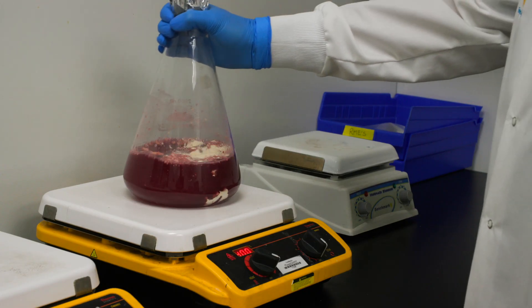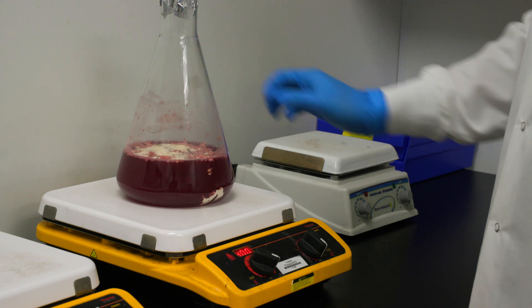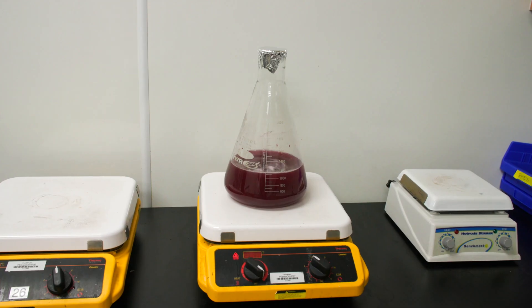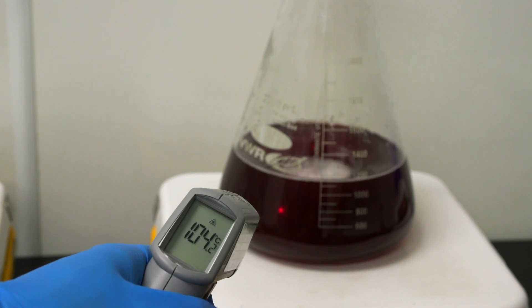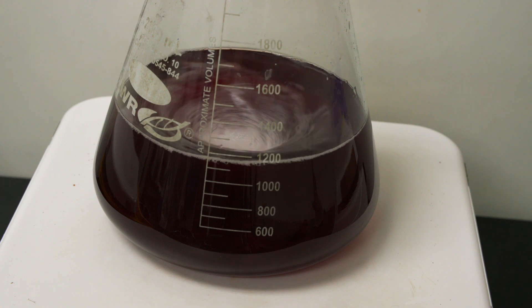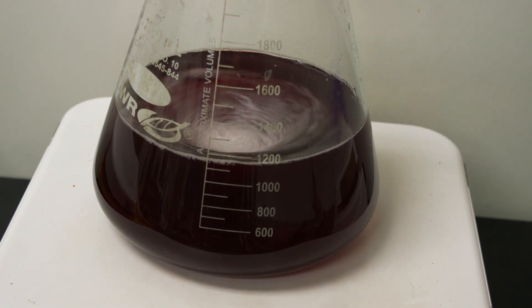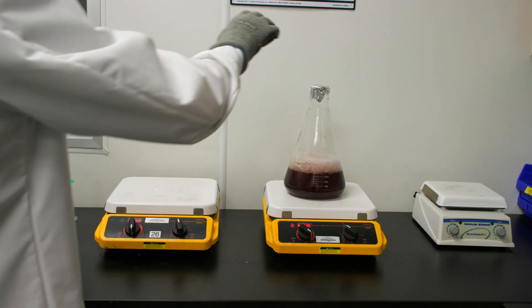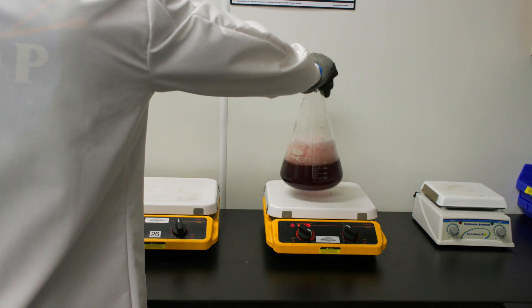Place the flask on a hot plate stirrer and bring the media to a boil while stirring using the magnetic stir bar. Be sure to mix and dissolve the media completely so there are no clumps. Boil the media for no longer than one minute — boiling for a longer period of time will turn the media dark and damage the nutritional properties. We are boiling just long enough to melt the agar.